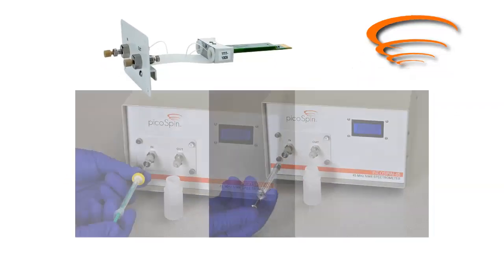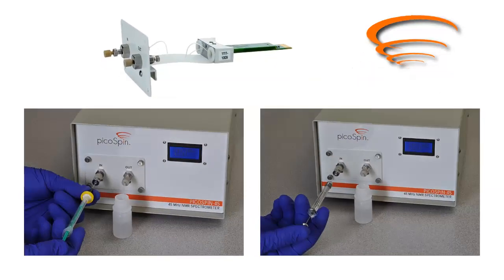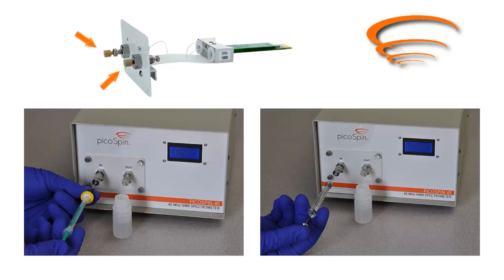Before we begin, let's inject a fresh sample of water into the cartridge, making sure not to inject air bubbles. You can monitor the waste tube to ensure a steady stream of fluid is passing through the cartridge. Also, be sure to cap both the inlet and outlet fittings after injection.